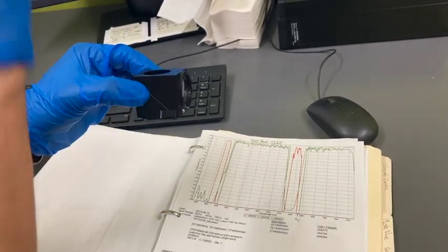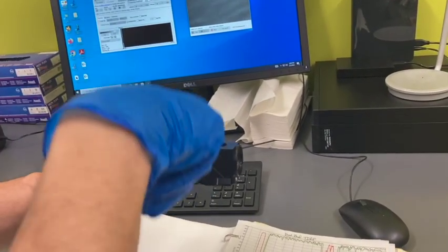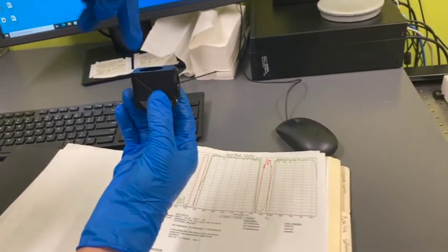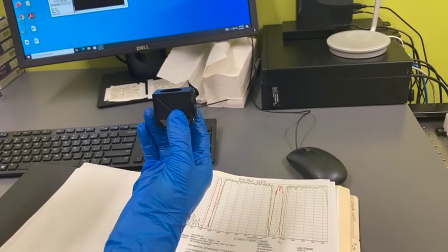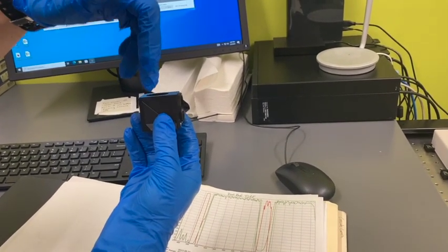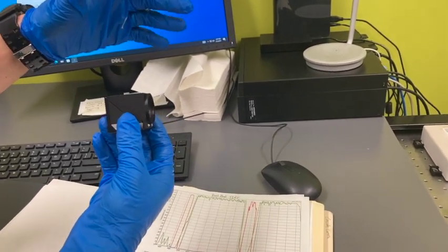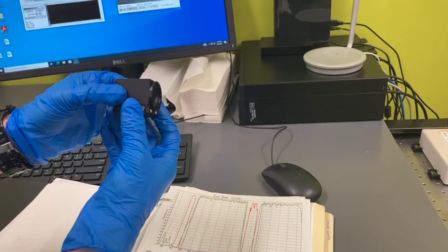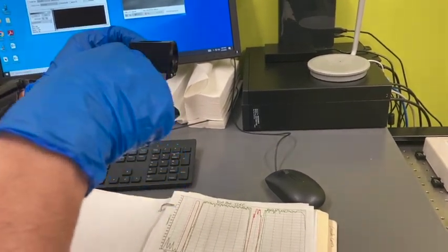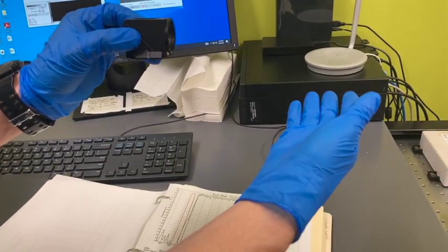when our laser goes up and excites our dyes, it will also reflect down, which means in our reflection we have our laser coming down, and we also have our dyes' emission going down together. And the laser is brighter than our fluorescence, so we need to block the laser, and there will be pure fluorescence going through to the camera in this way.